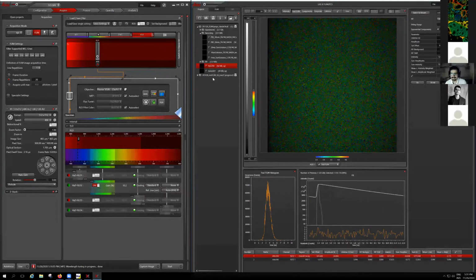Yes, exactly. That I was really thinking, frustrated. Why do I always get a longer lifetime than expected? It's ranging between 30, 40 picoseconds to 110, 120 picoseconds. Usually it's longer. So what I did, I used internal detectors and I got the same result. And I did single photon excitation, and I got almost the same result as well. So it seems this is the value that I get.